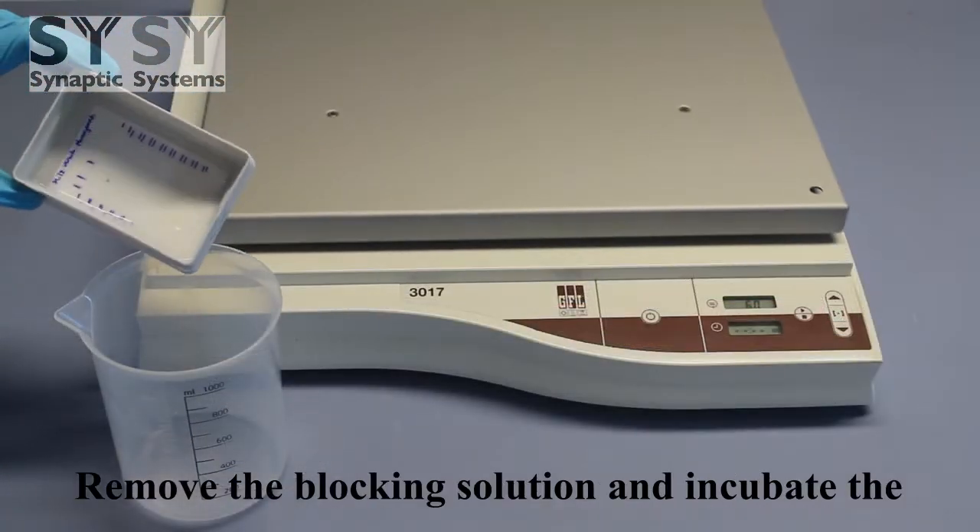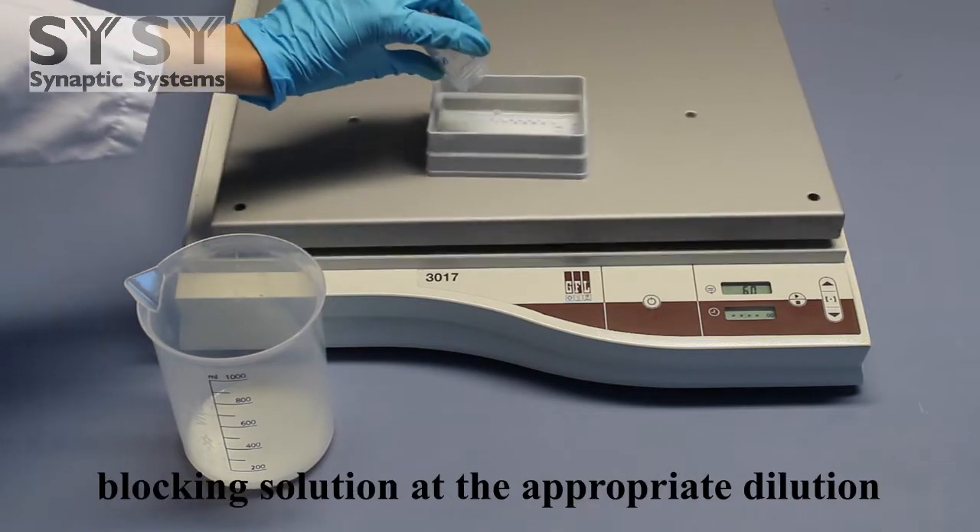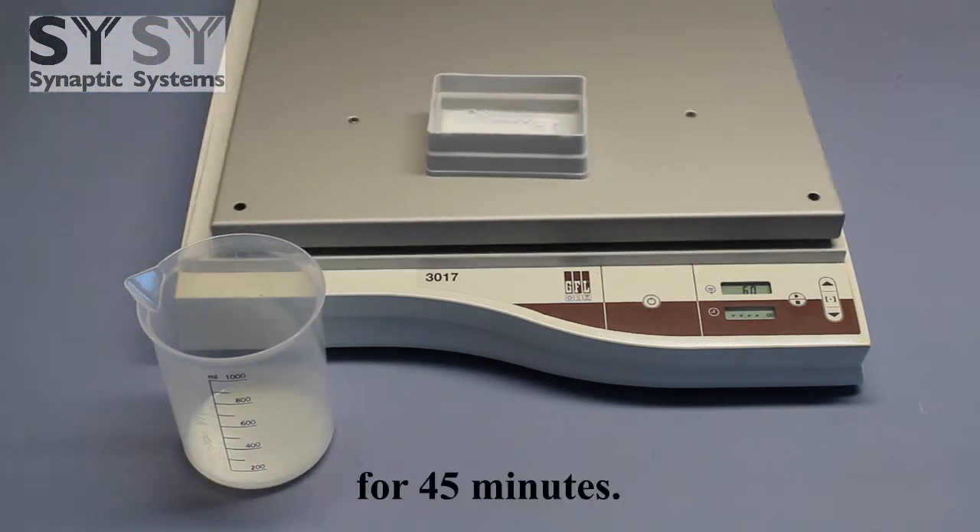Remove the blocking solution and incubate the membrane with the secondary antibody in fresh blocking solution at the appropriate dilution for 45 minutes.